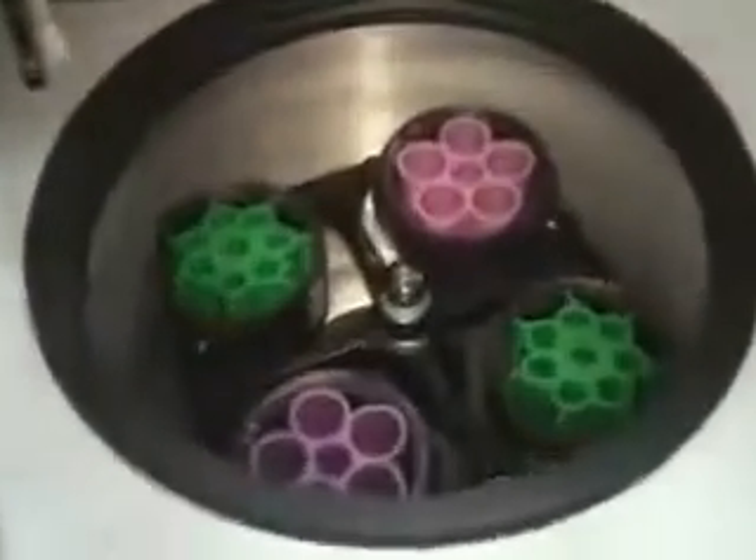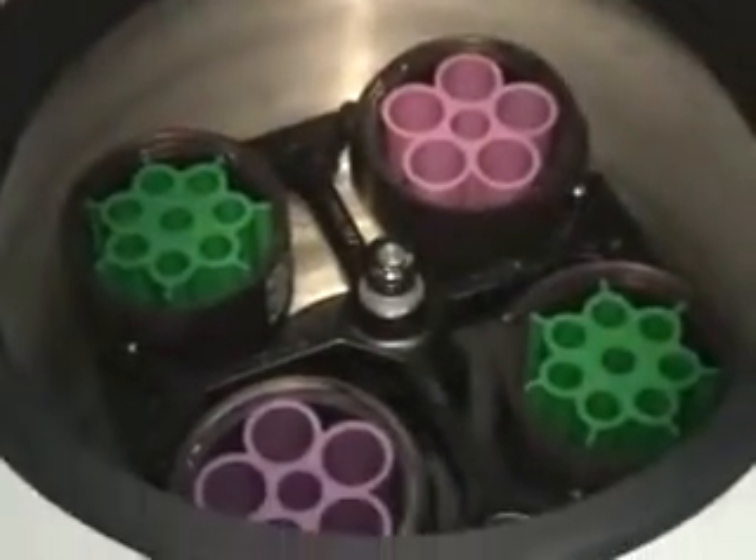You don't need a rotor, but this is the configuration that we're spinning this afternoon. I'm just going to close the lid.